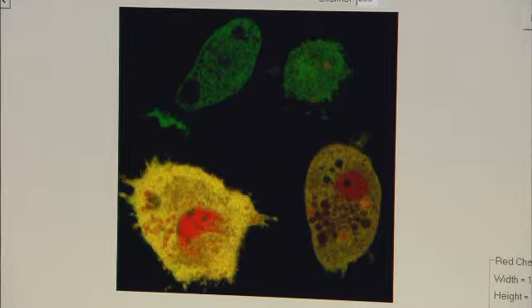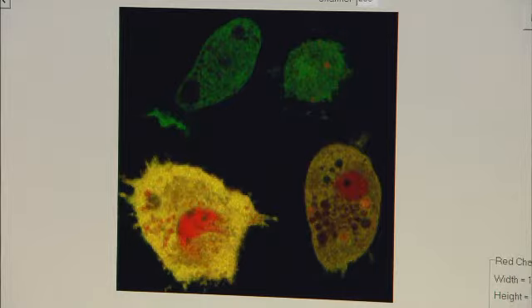Let's go down through the cell and see what it looks like. Wow. That's pretty amazing.